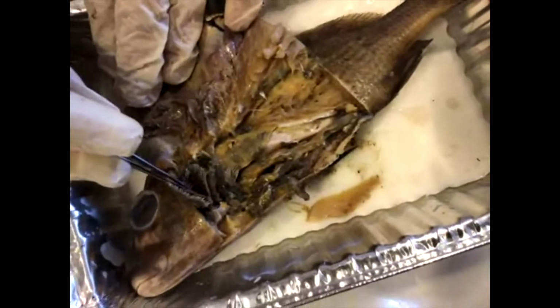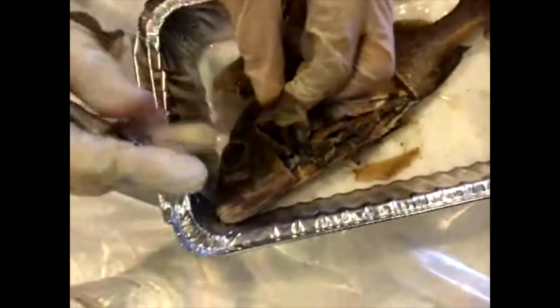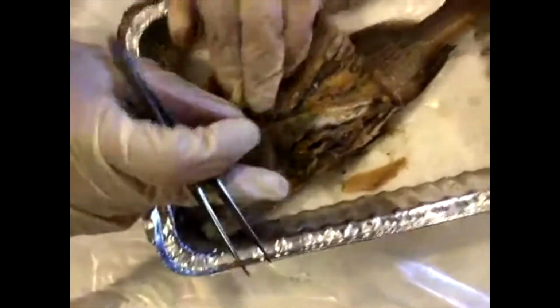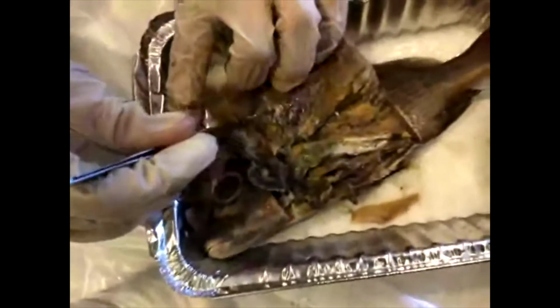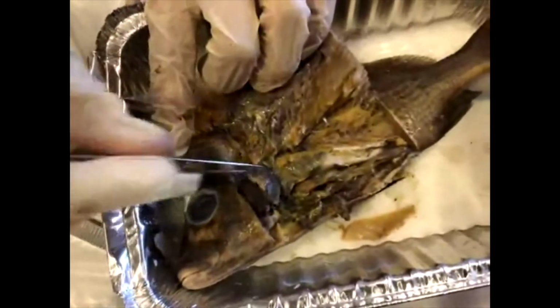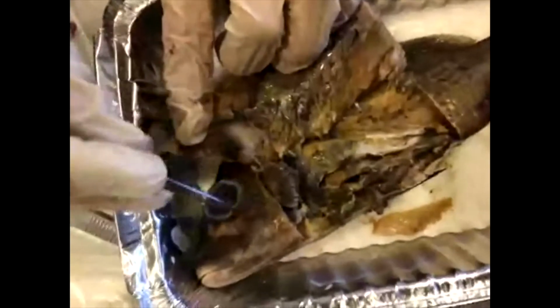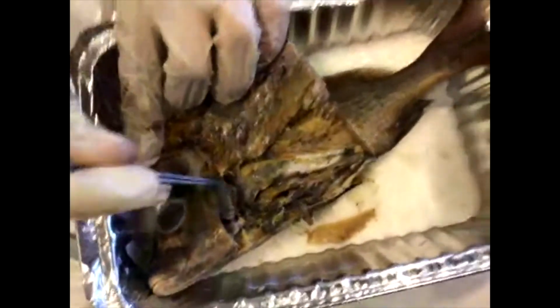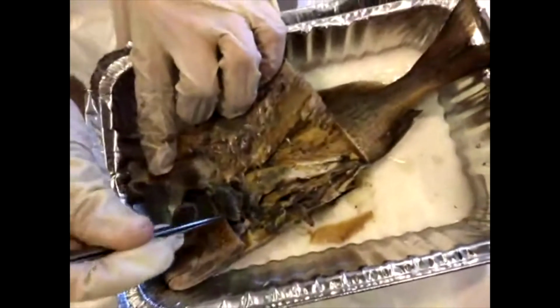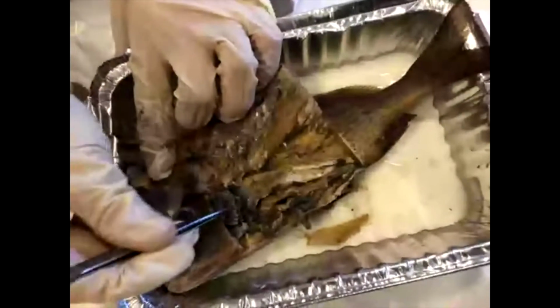So we've got 4 gill layers here, and I cut them out a little bit, but this operculum has a big long bone along here to protect them all. So you can draw your gills right up. It's quite close to the eye, you'll see, but right at the edge of the window that we've cut. And we'll take note that they're really fan-shaped and quite feathery. So you might want to draw that into your drawing a little bit.